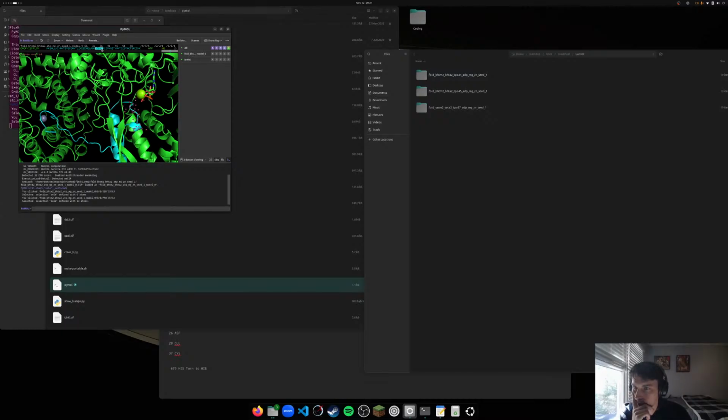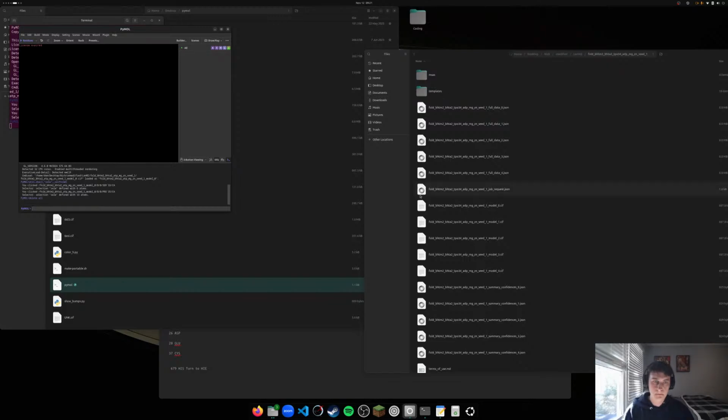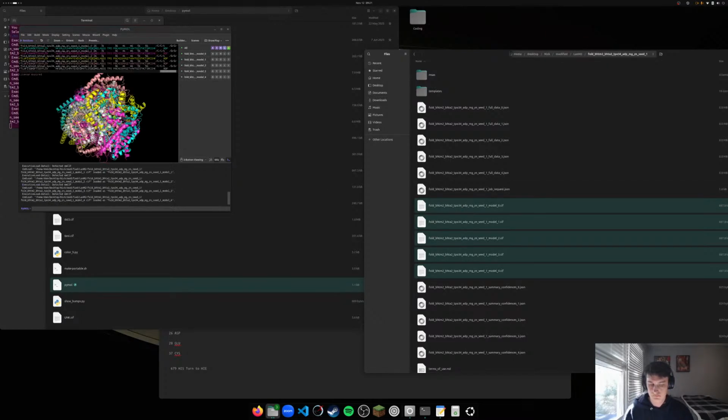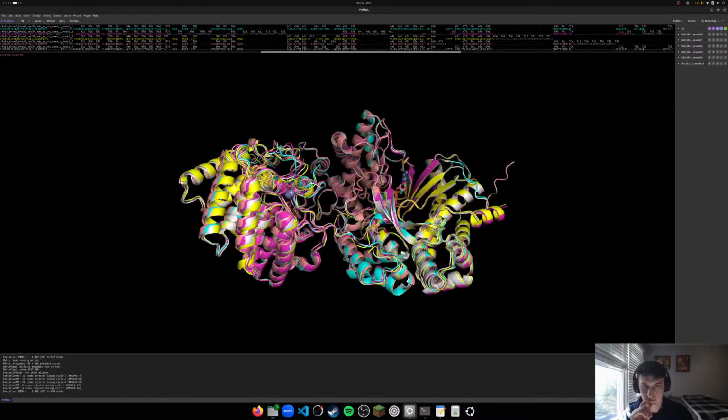So we want to go probably 34. Look at those. There we go.